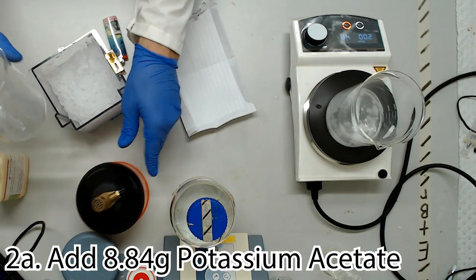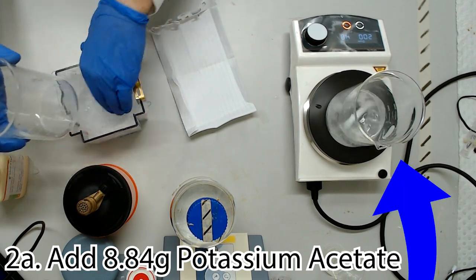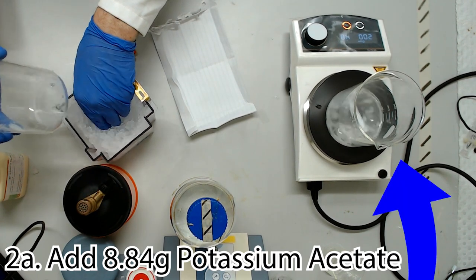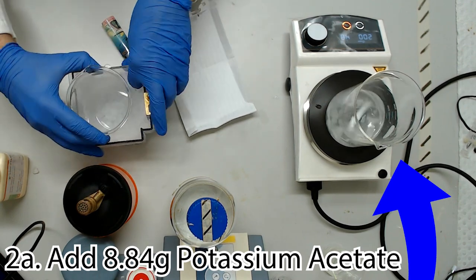Now, if you have pre-prepared potassium acetate salt, simply add 8.84 grams to your beaker of guanidine hydrochloride solution. For those who don't, let's take a detour to prepare the potassium acetate.